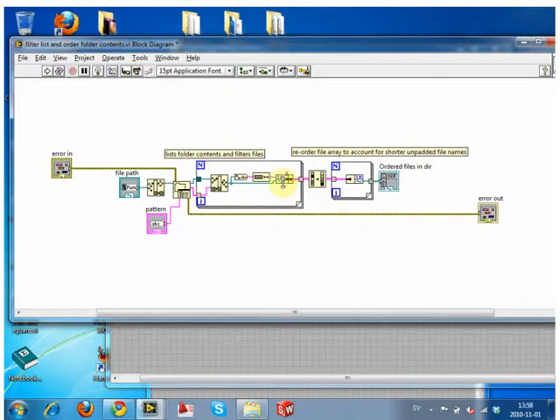And you're doing this loop, and then this ordering, and then this loop. Essentially, you're putting a secondary attribute on there, reordering it based on the first attribute, reordering it based on the second attribute, and then pulling that attribute back off because you don't need it. That was there for the sole purpose of creating a list. But the result is, first of all, we find out what's in the folder. We filter it based on what we say filter. And we then order them based on an ordering scheme that we know to be more sensible.